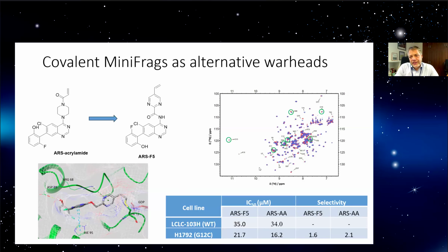We first investigated the binding site of this compound, and as you can see here, we identified the most important interacting amino acid residues using HSQC NMR technology. On the basis of these investigations, we confirmed that the binding site of both of the covalent KRAS G12C inhibitors is basically the same. At the bottom, you can see the binding mode of the heterocyclic version of the G12C inhibitor.